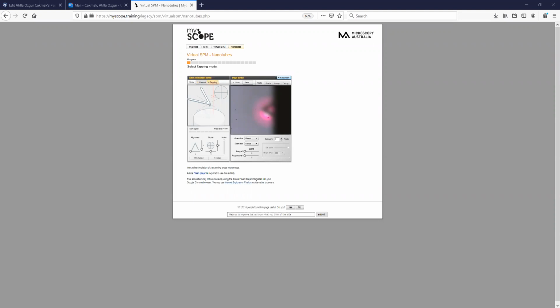Okay, and then we'll have to disengage the tip, of course. So you can see the optical microscope imaging here. And we just disengaged. We can engage again, so that's now in focus. If we disengage, that's going to be out of focus. And using the motor, we can really pull it up and take my sample out and take my cantilever beam out without damaging any of these things.